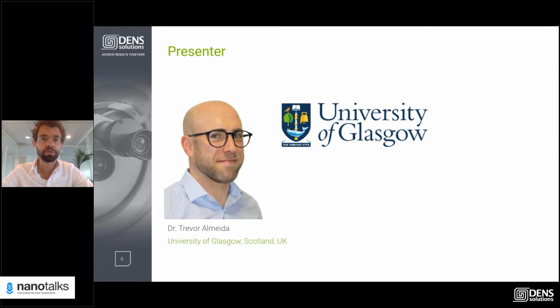Trevor then decided to expand his research further to include visualizing magnetism of complex nanostructures for technological applications using the world-leading TEM for a range of Lorentz microscopy techniques at the University of Glasgow. His current research is focused on combining in-situ TEM with magnetic imaging to visualize directly dynamic magnetic processes in thin films and biomagnetic nanostructures.